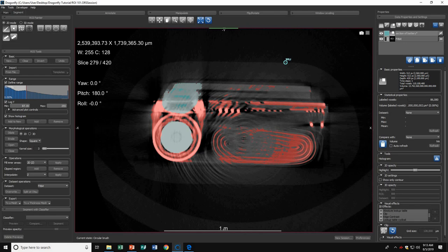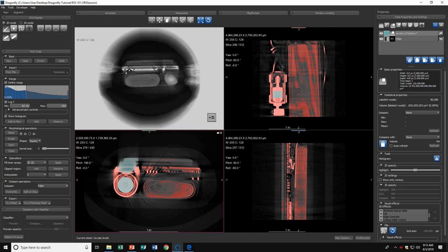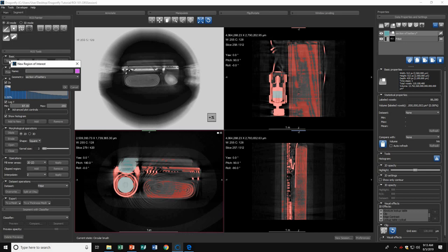Another useful tool in the ROI painter is the 3D mode. I'll create a new ROI to show you. I'll call it Section of Battery 3D. For the dataset, I'll use Fitbit.